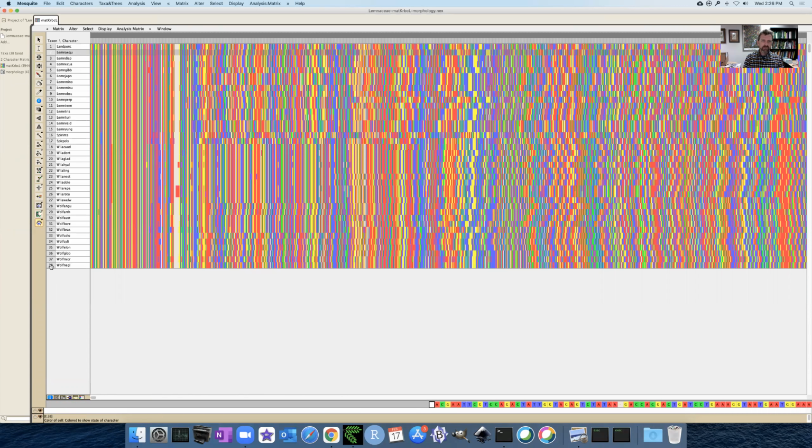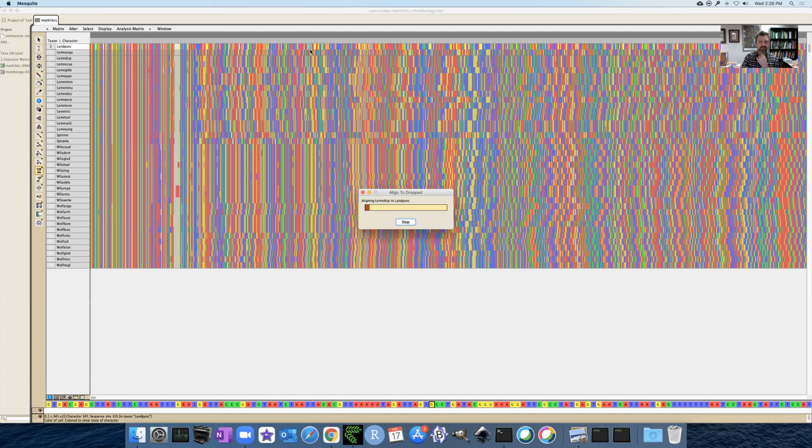There's a way to save some time on this. I'm going to align a set of sequences to a reference sequence. So I'm arbitrarily going to choose the first species as a reference sequence. It's also in its own genus, so it might be the most, I don't know, the most neutral comparison point for the other species. And fortunately, it's pretty quick at this. So hopefully after this, we'll get a pretty good alignment.